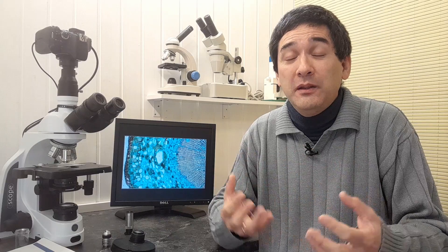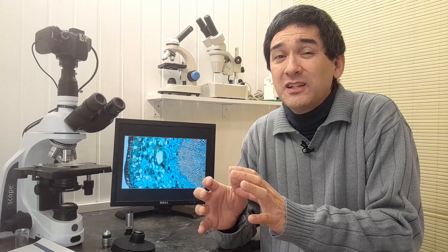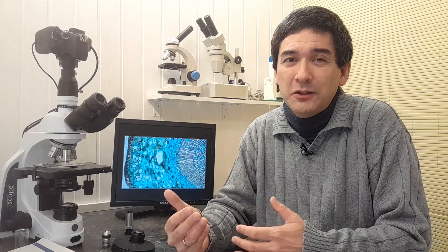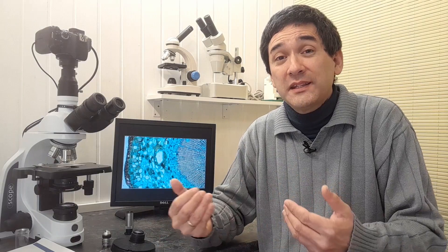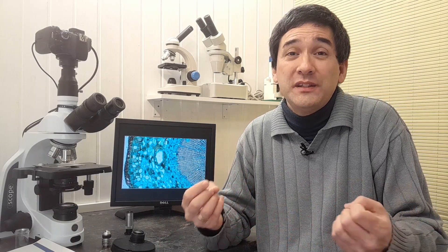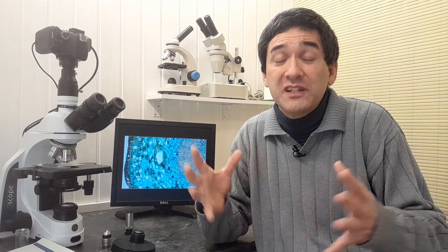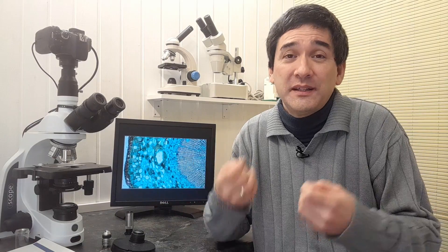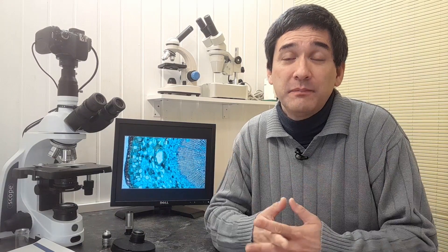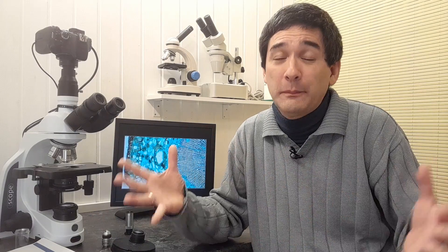One of the reasons is because phase contrast microscopy, while it makes very difficult to see objects visible, the specimens don't always look very good. So you're losing color, you have the natural colors kind of disappear and everything looks much more gray, a grayscale. And for this reason, it might not always be quite as attractive. And depending a little bit on the specimens that you want to observe, the colors are not quite as colorful as you might expect them to be. And for this reason, it might not be very useful for general purpose microscopy.